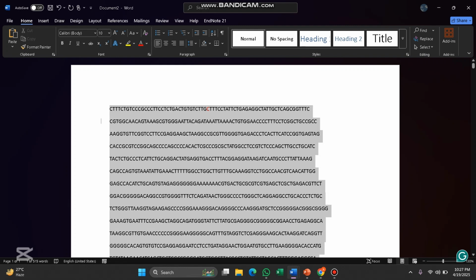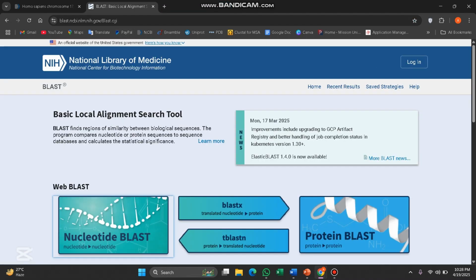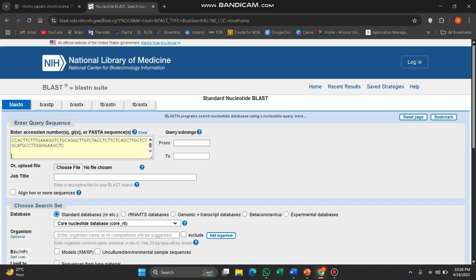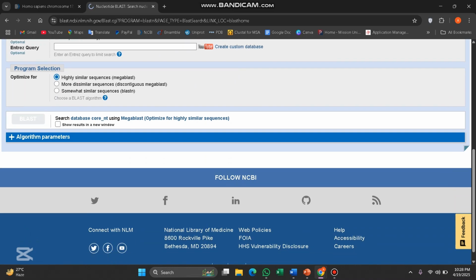Okay, just Control A and Control C, copy that sequence and use BLAST again. Copy and paste it here. This sequence is the mutated one. For example, this is the patient's sequence, and just click on BLAST.